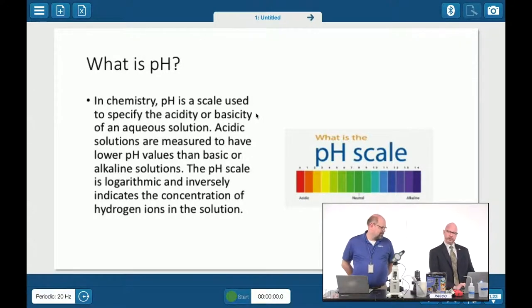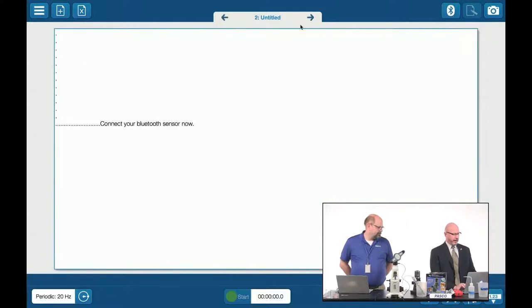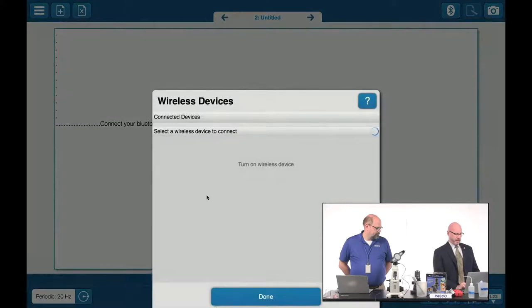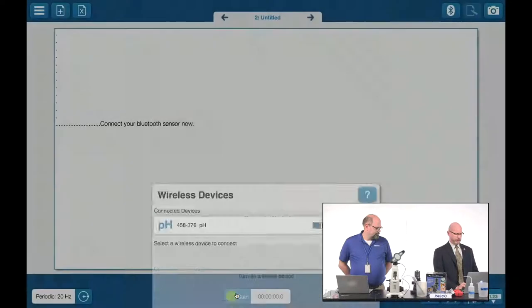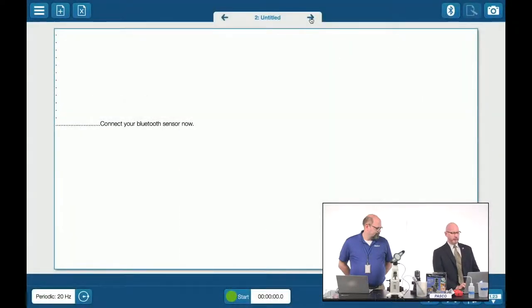I start off with an introduction slide about what is pH and the pH scale. And then I go to slide two, and it says, hey, connect your Bluetooth sensor now. Okay, well, I can do that. I'm going to turn on my Bluetooth sensor. Assuming my kids are there, I would have my sensor. I'm going up into my Bluetooth icon, I'm going to find my pH sensor. Here it is. I'm going to connect to it. I'm connected. And now I move on to the next slide.